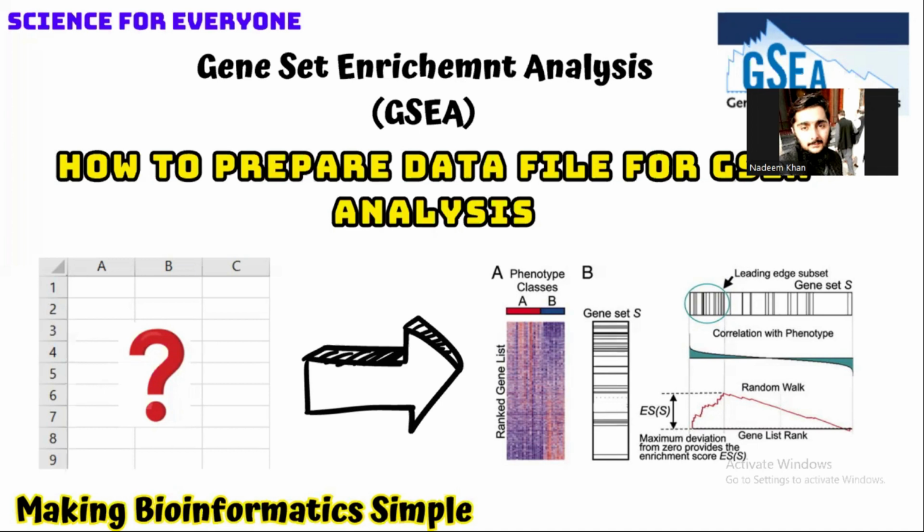Today's video is related to gene set enrichment analysis, and the title of my video today is how to prepare a data file for gene set enrichment analysis. This video is very important for you because when we are using different software and tools to process our data, they need a special data format and a special data type. What type of data should be arranged in the rows and columns of that file so that it will be accepted by the software or the package? This is very important for data analysis.